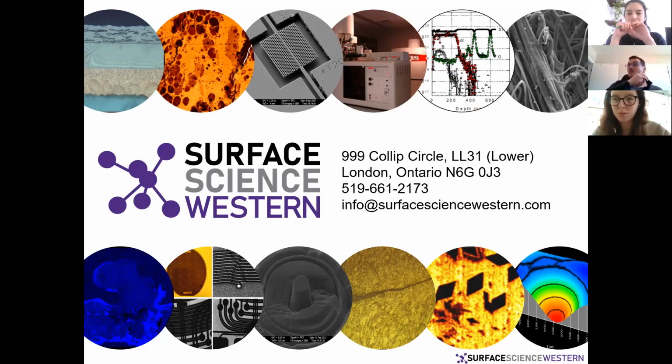We've done that with uranium. We have some students working on uranium chemistry, and they've developed their own processes and procedures based on standard spectra to quantify how much uranium 4, uranium 5, and uranium 6 they have. But it's basically the same sort of thing that we've done with the first row transition metals. Okay, thank you a lot.